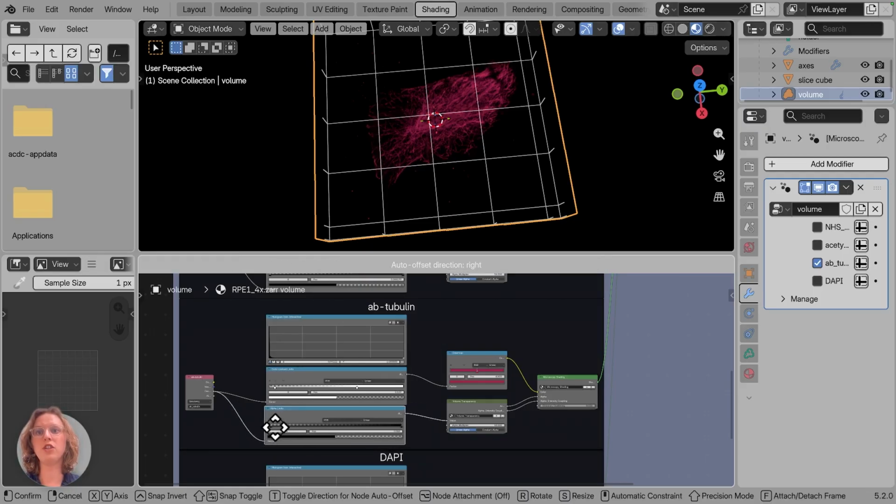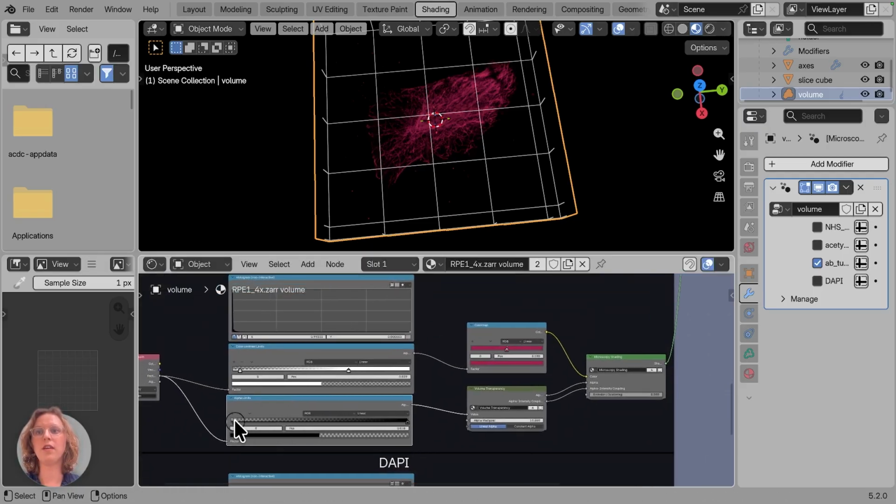So we can change the minimum value of the data to be included to be opaque by changing this minimum value in the alpha. Currently, the color limits don't do anything because we only have a single color set. We can read this left to right and follow the lines. The color limits go through this color map and then go into the shader. And the transparency goes into this transparency map and then goes into the shader.